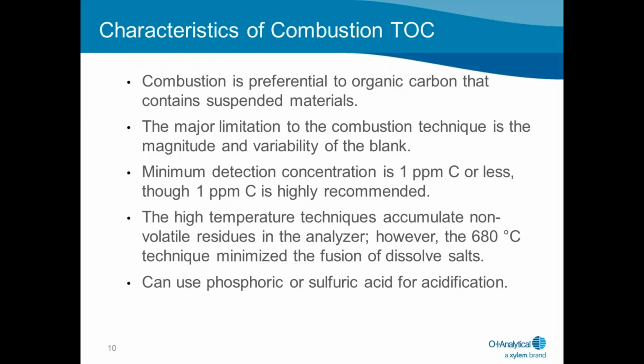First, let's go over some of the characteristics of combustion TOC. I take these from Standard Method 5310B because it does offer pertinent information on the combustion TOC technique. While this is not a complete listing of all of the recommendations, these are the most salient points about this technique. In general, the combustion TOC technique is applicable when the TOC concentration is above 1 ppm.